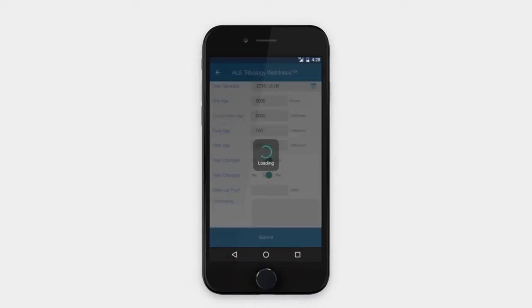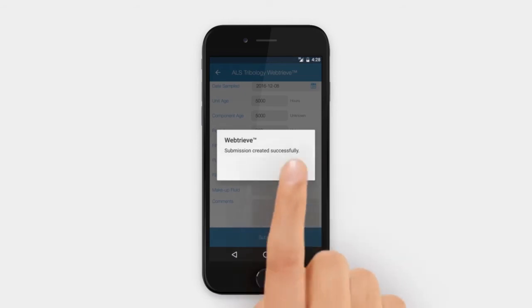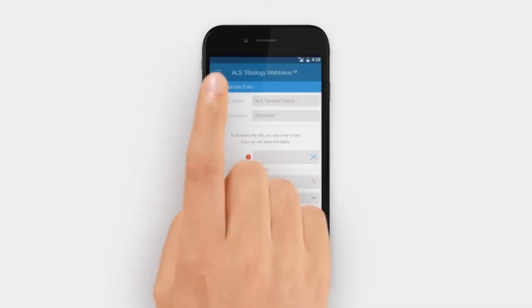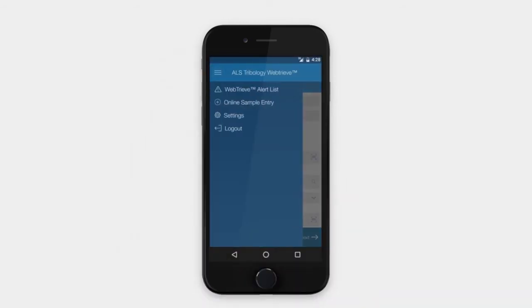Once you complete all the compartment information, hit submit and the sample details will be transmitted to the laboratory.